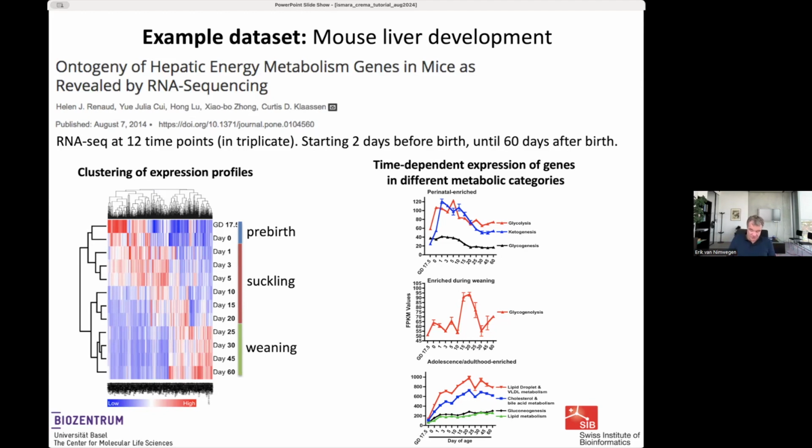So in contrast to single-cell RNA-seq, where the depth of sequencing is basically controlling everything, in bulk RNA-seq, it's typically the case that the sequencing is deep enough for most typical RNA-seq datasets that you get, that actually for most genes, the estimate of the gene expression is relatively accurate. So the size of the actual error bar on the gene expression itself is small relative to the error that the model is going to make in any case, right?